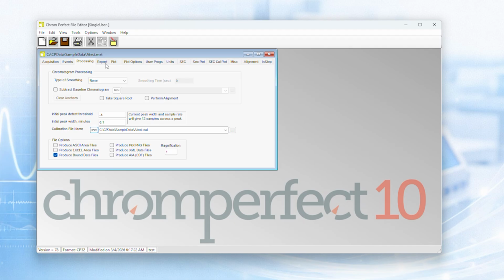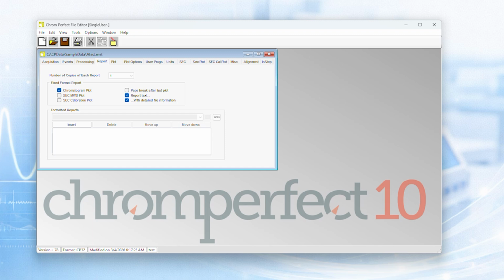Next is the Report tab. The Report tab defines what reports are generated from processed data. Chromperfect allows a single method file to contain multiple reports. You may configure a detailed chromatographic report for the analyst and a simplified summary or suitability report for supervisory review, all within the same method.